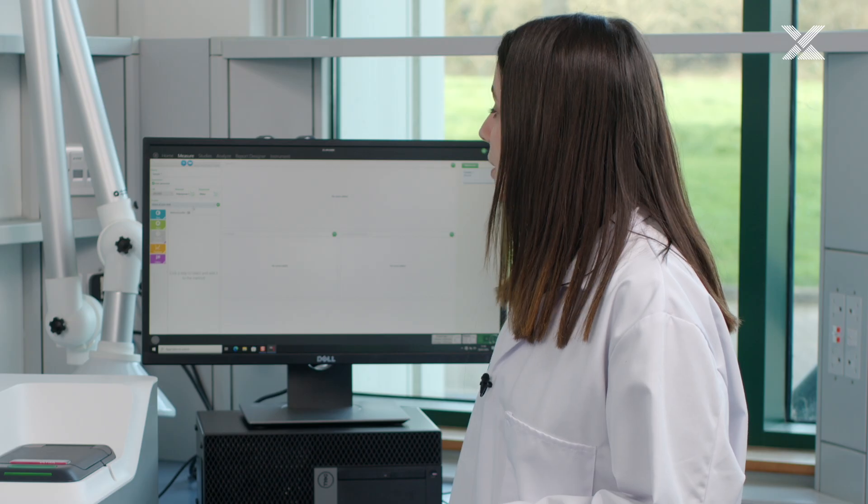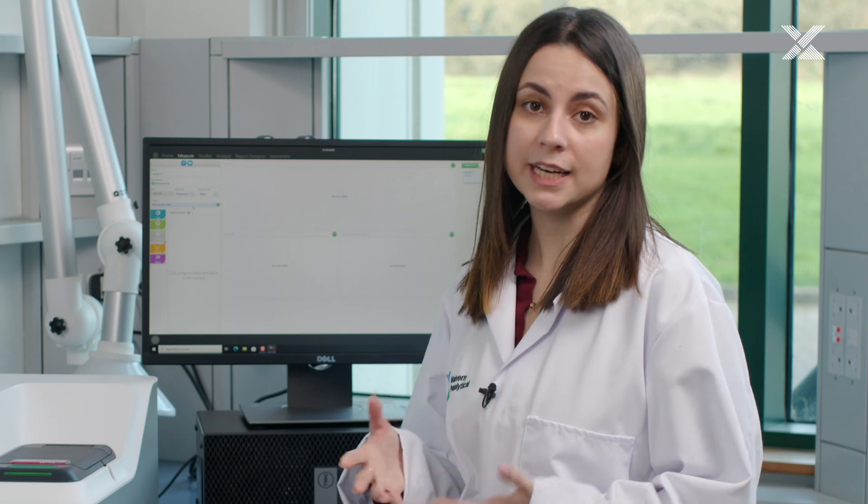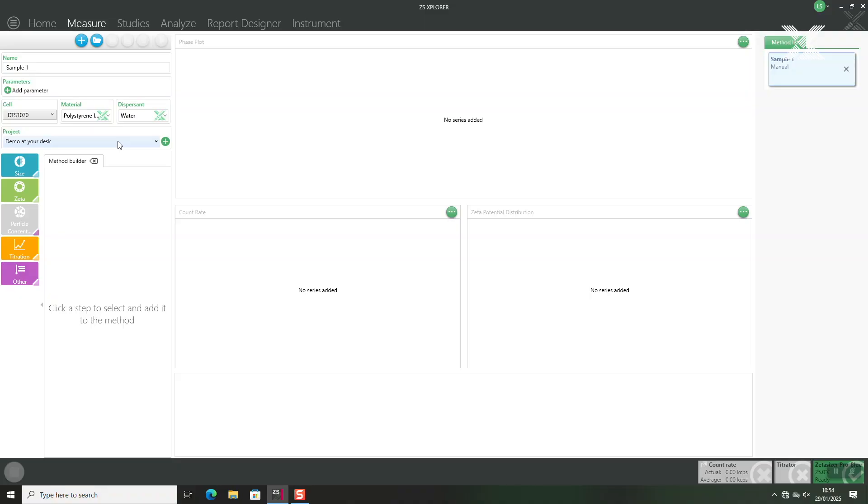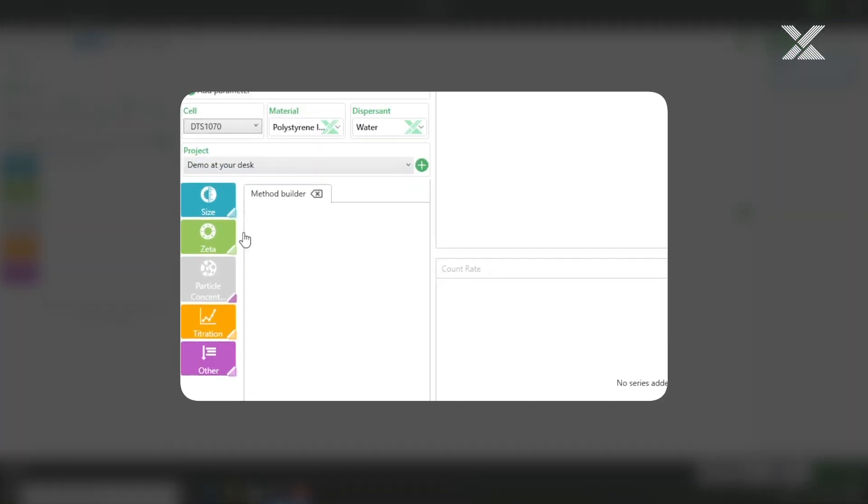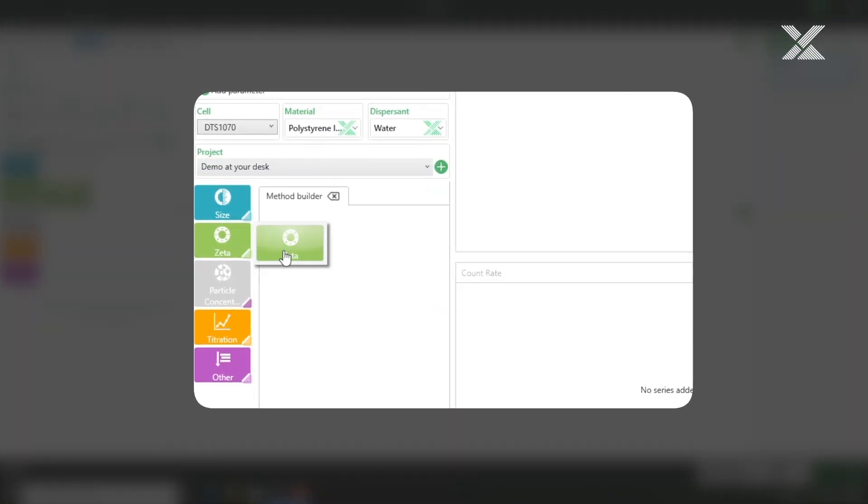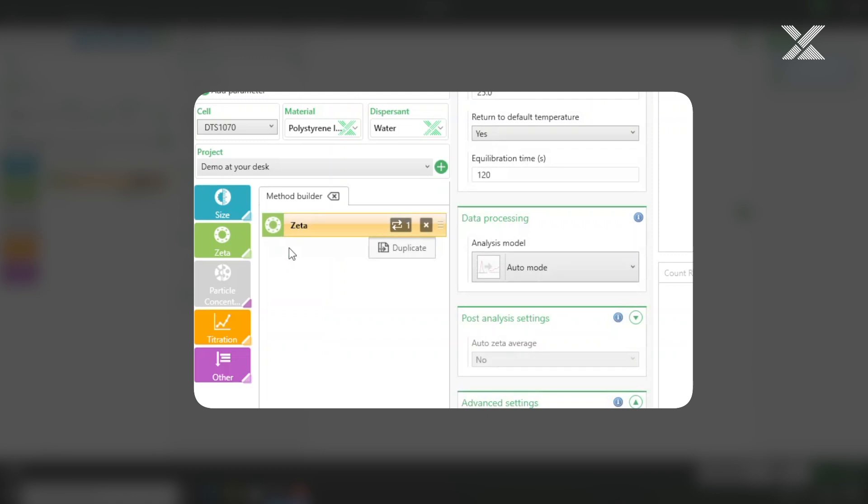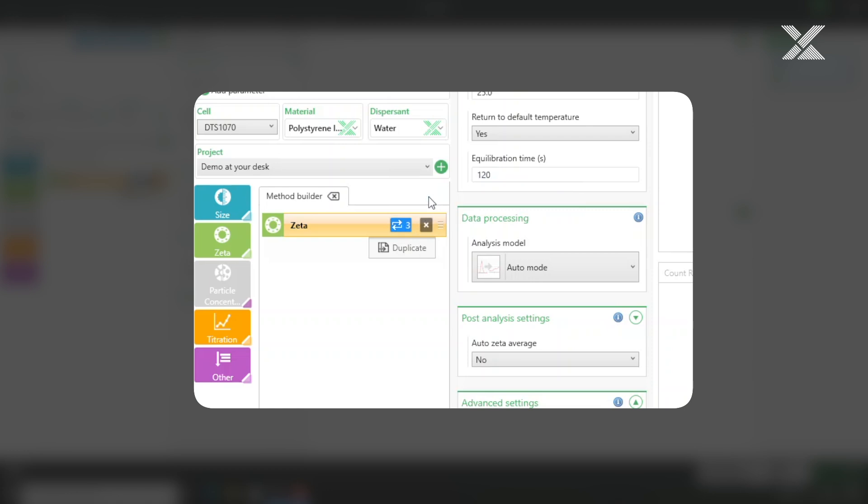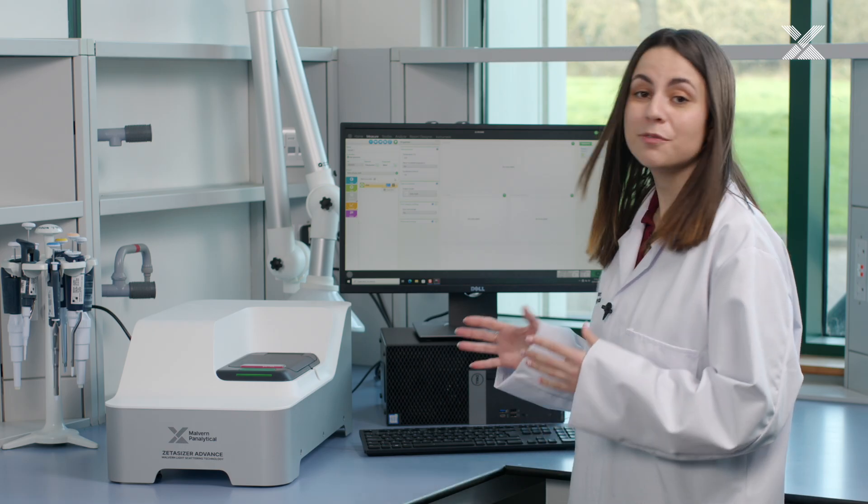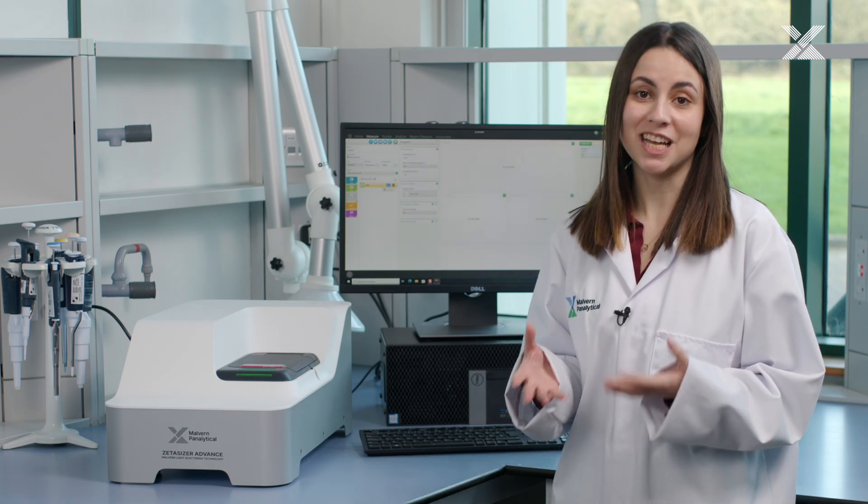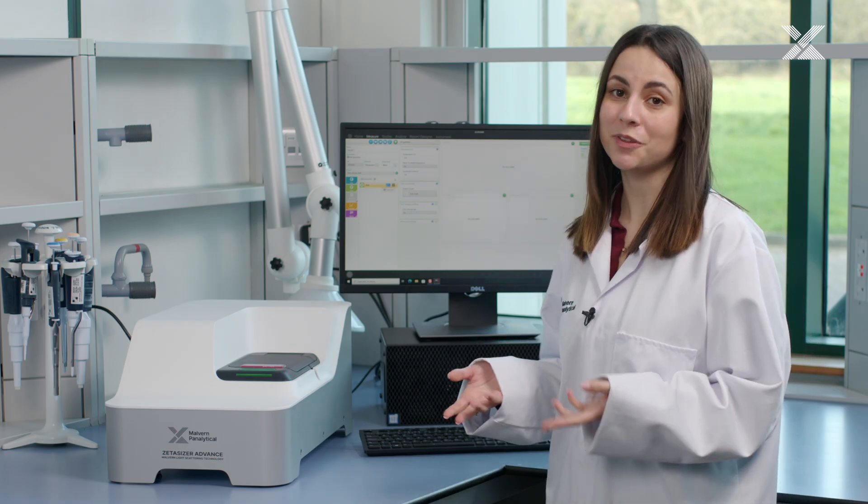Then we need to select our project where our measurements will be organized under and then we can actually move on to selecting the zeta potential measurement. We can define how many repeats we would like to do and then for most users at this stage we can actually commence with the measurement.